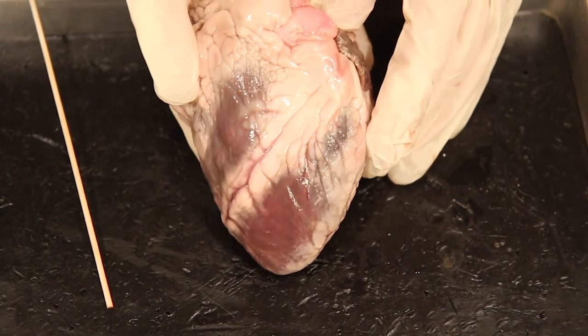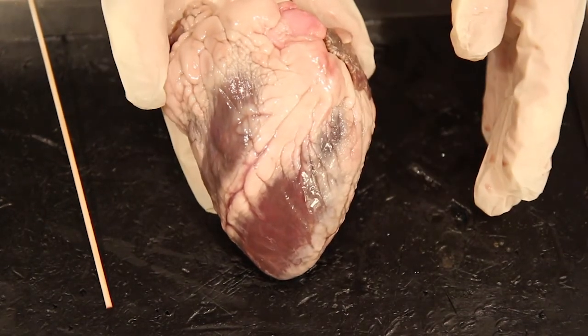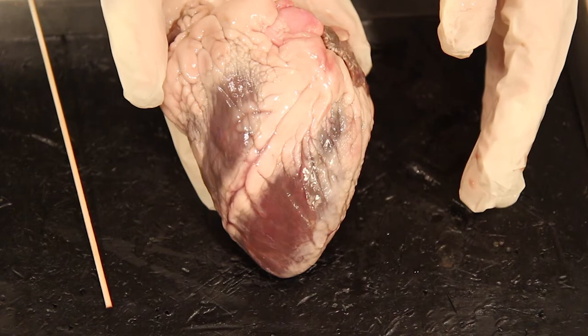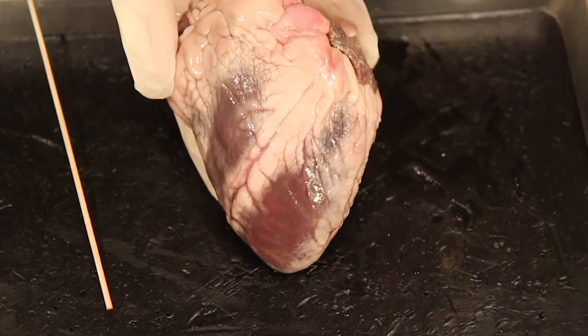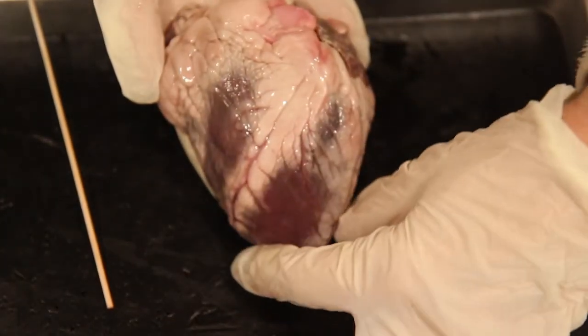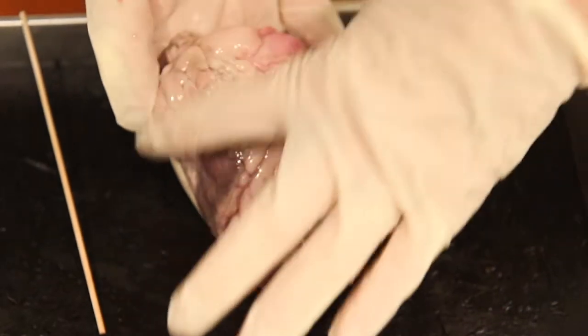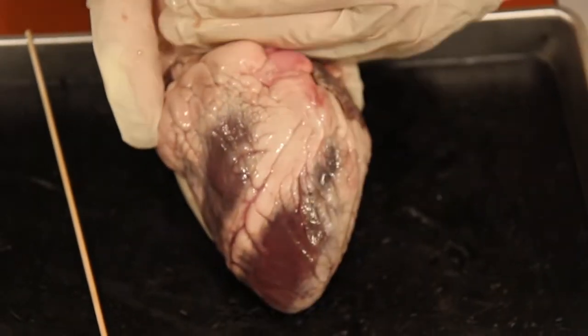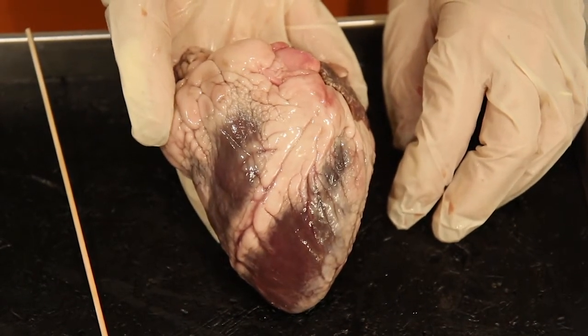Let's move on to three — identify the base and the apex. Remember that the base is the broader of the two sections, so the base would be here pointing up, and the apex is the narrower end pointing down. This would be the base and this would be the apex of the heart.